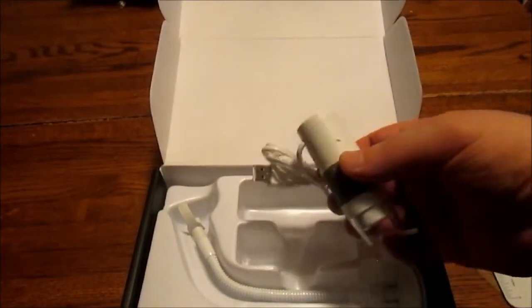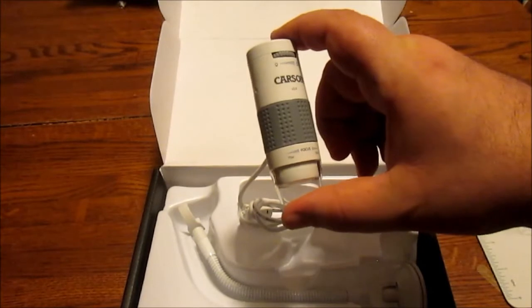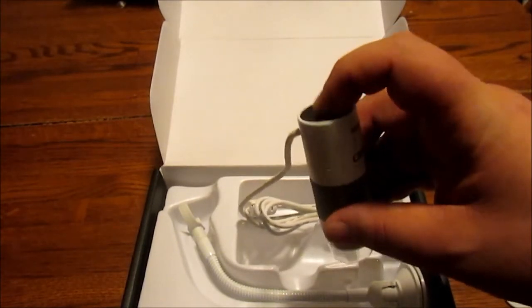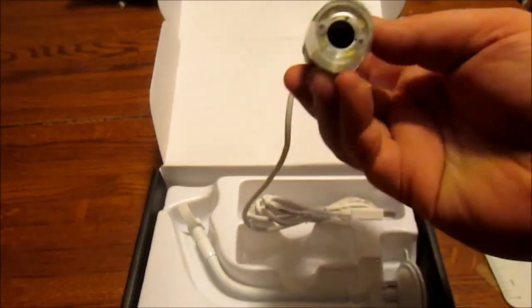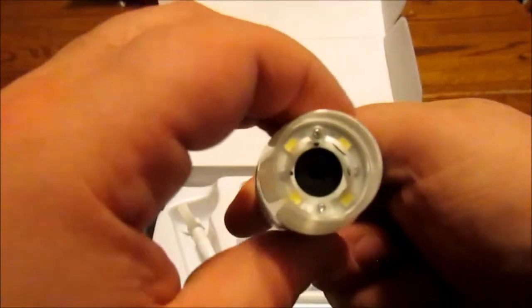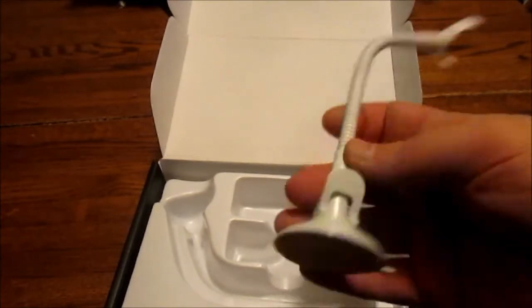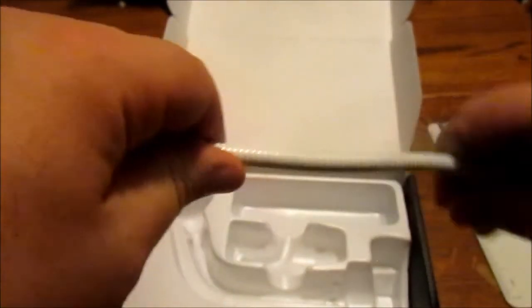The camera unit is tiny — probably only about four inches long. It's got a touch-to-capture button on top; it's capacitive, so there's no physical button press. You can see the LED light control and focus control — the LEDs and the lens are right in there. The focus just raises and lowers the lens on the interior. The arm and suction cup are actually heavier than the camera itself — it's pretty rigid, a flexible conduit but actually quite nice.